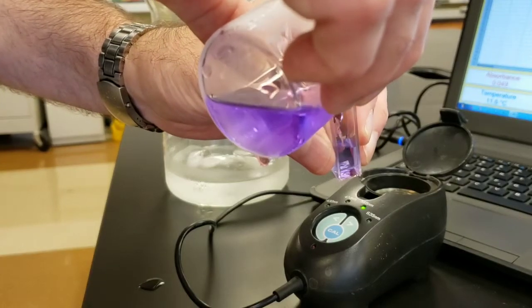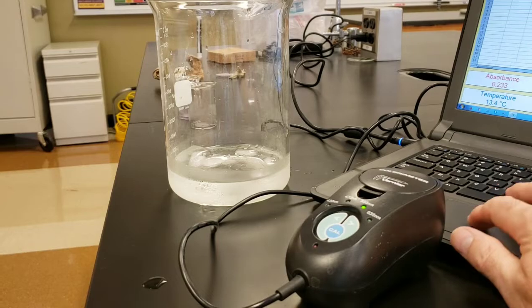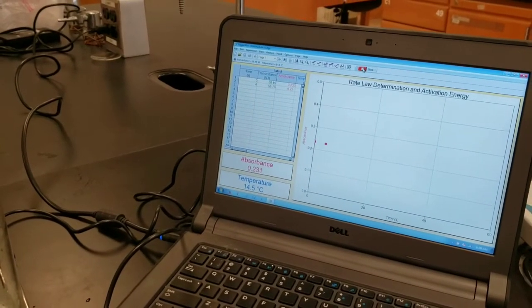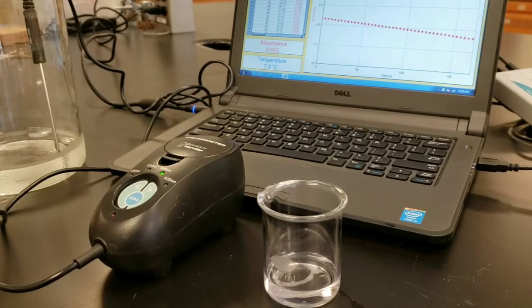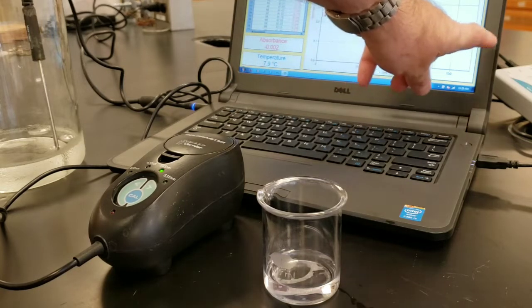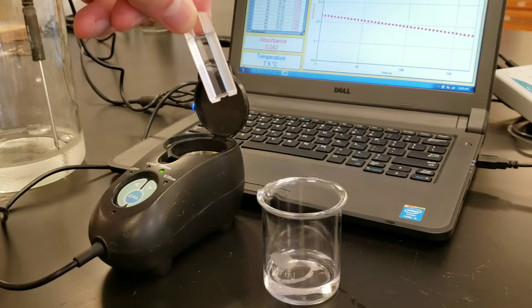Pour the solution 3/4 of the way into a cuvette. Put that cuvette into your colorimeter, and then press collect. Over the course of a couple of minutes, the purple reaction solution has lost its color, and you can see on the absorbance plot that this is linear, and it shows that my purple solution has now become essentially colorless.